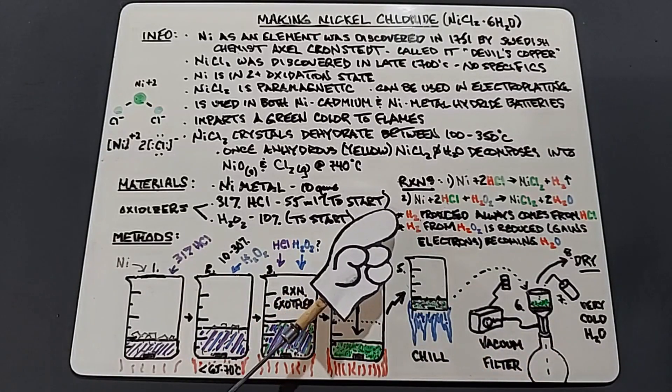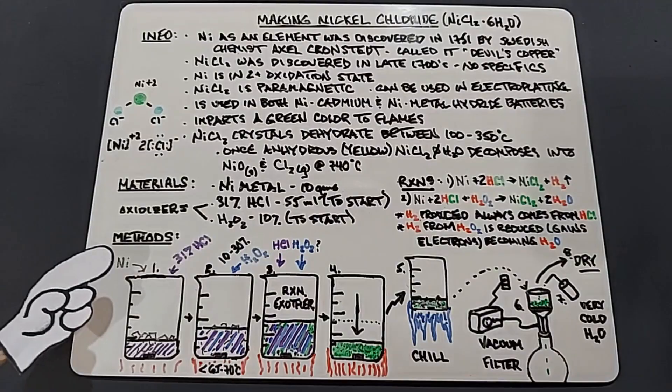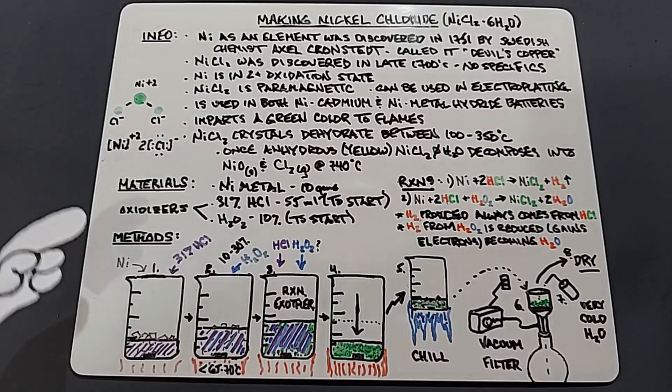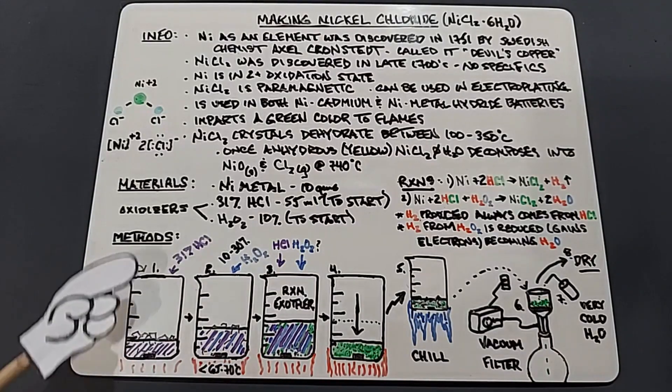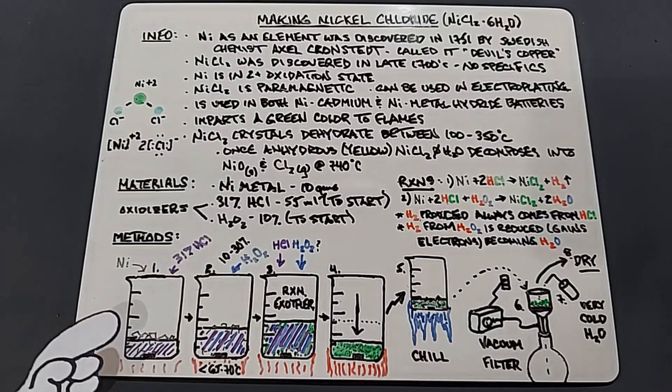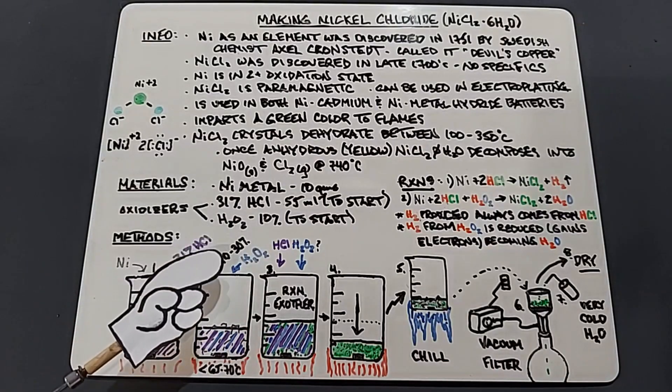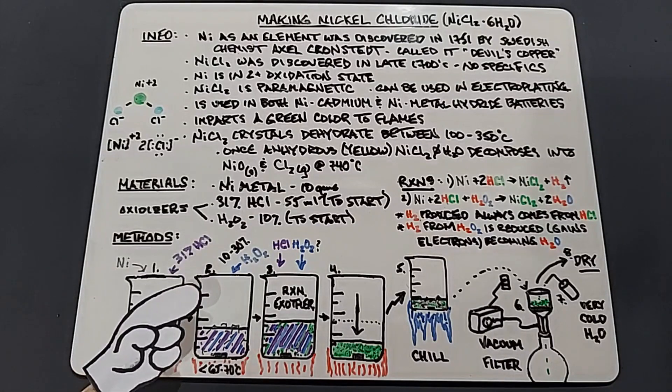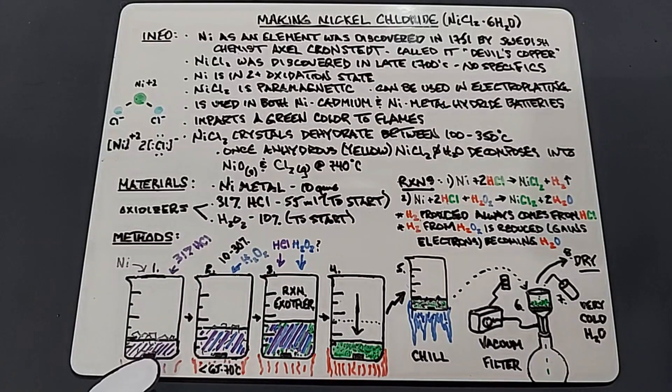In our methods, it's actually pretty straightforward. We have our nickel metal, our strips, we're going to add the 31% hydrochloric acid to start with, 55 milliliters, and then of course adding the hydrogen peroxide will improve our results of breaking down the nickel.